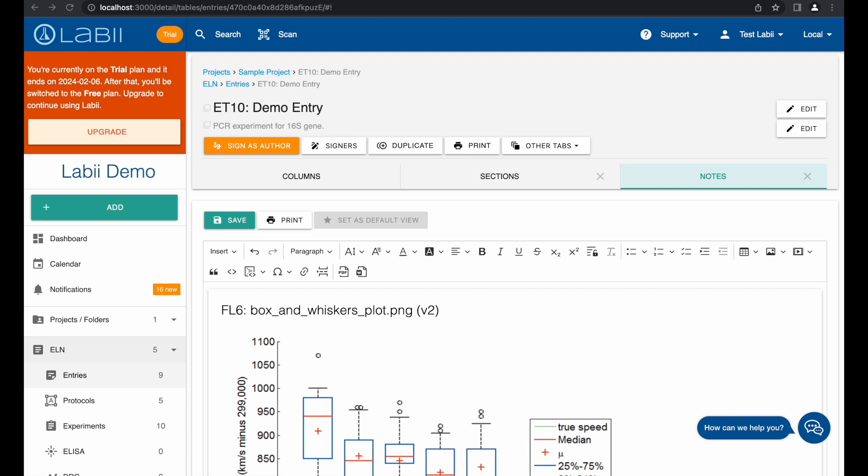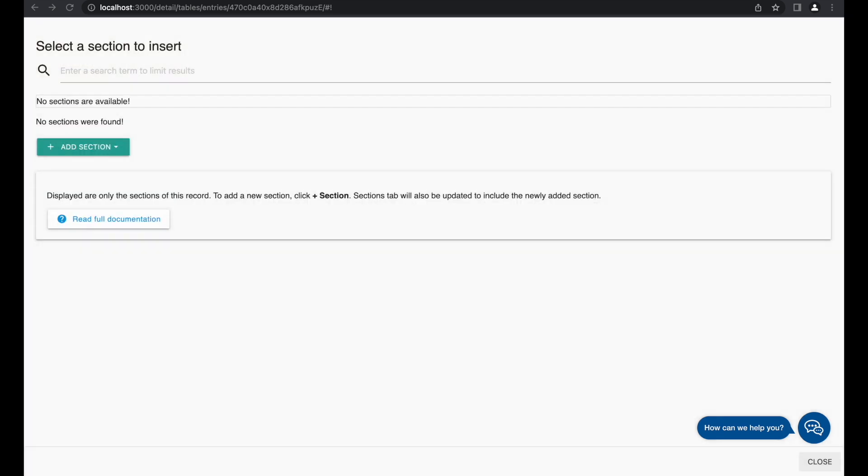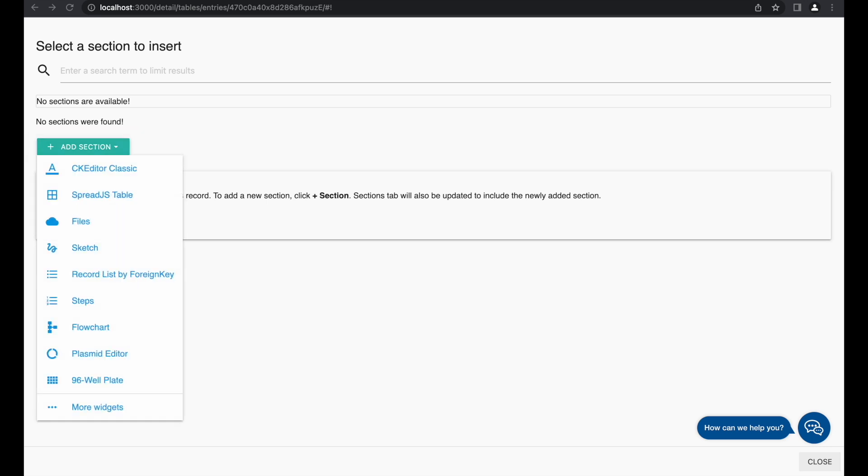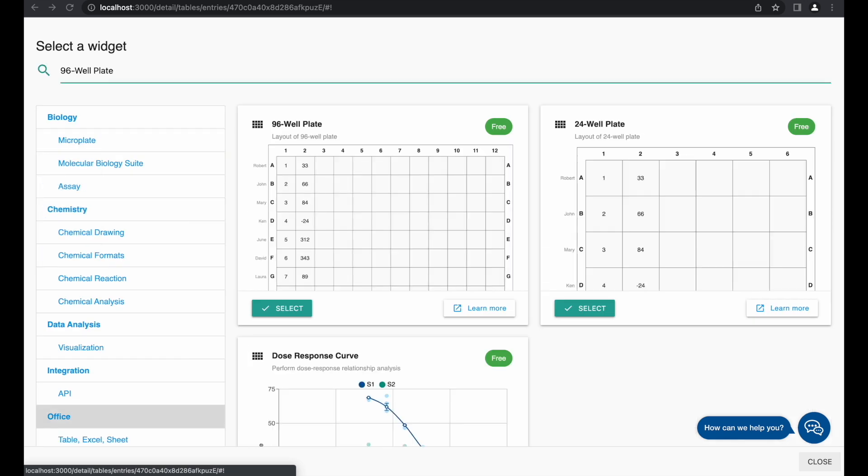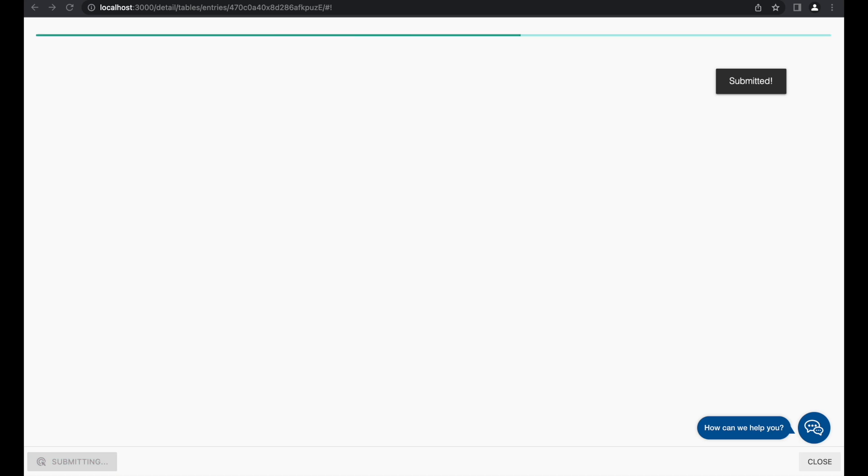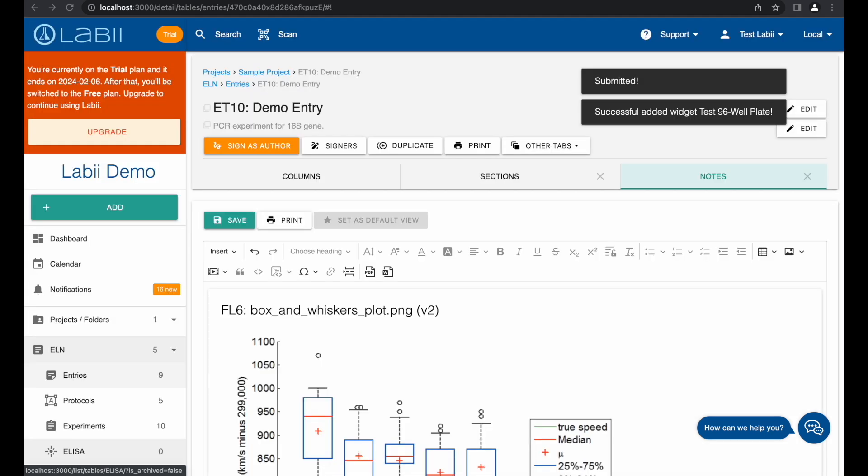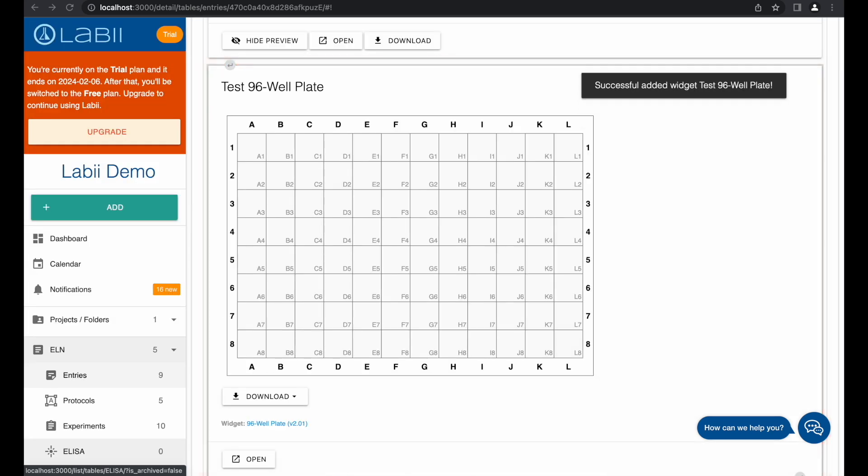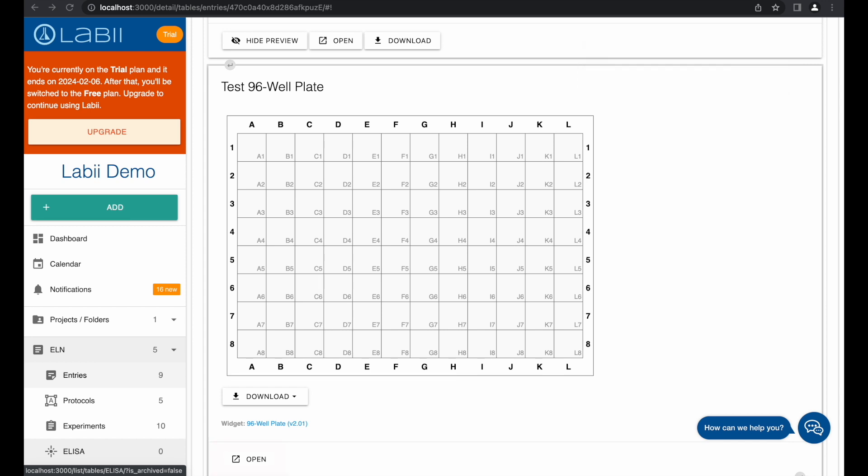Click on the Insert menu and then choose Section. You can select a section that already exists, or insert a new section. You can open the section in a new tab and update the data of the section.